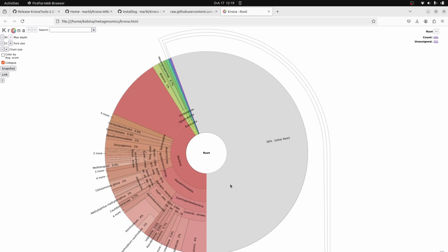It's so cool. This is what Krona can do for us. Krona is not just for metagenomics data visualization. You can also use it for other visualizations, provided you have put your data in the right format, then you can visualize using KronaTools. If you want to do these things, you can also book a session with me and we will look at how to do that. So this is how we install and set up KronaTools, and we have also tested it. Now we have your outputs, and then you can start interpreting.